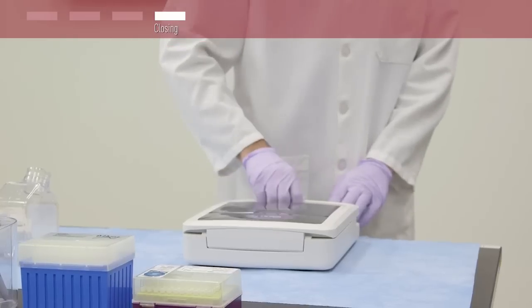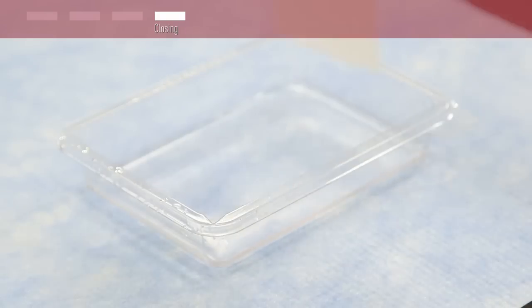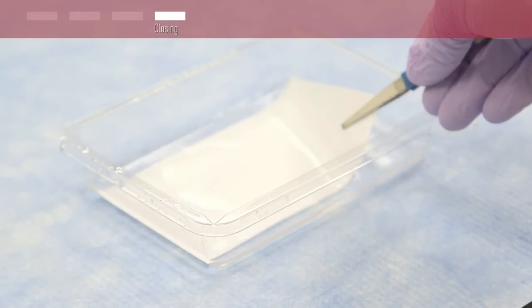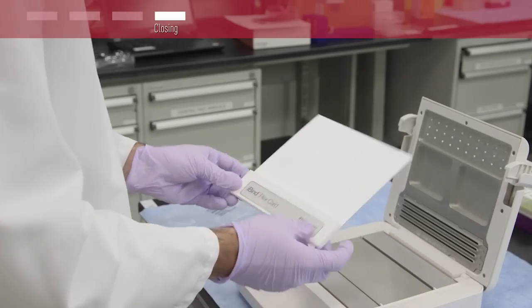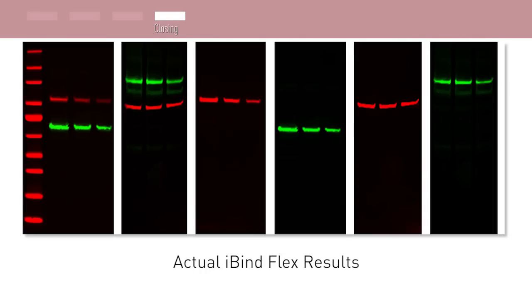After the experiment has completed, open the lid, rinse your blot in water, dispose of the used iBind Flex card, and proceed to your chemiluminescent, fluorescent, or colorimetric immunodetection protocol.